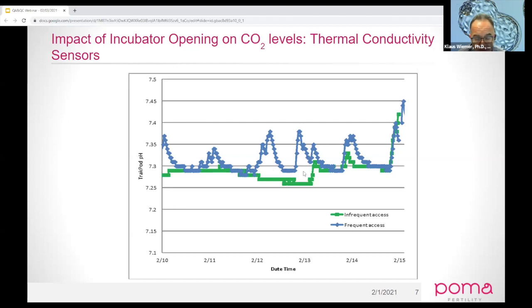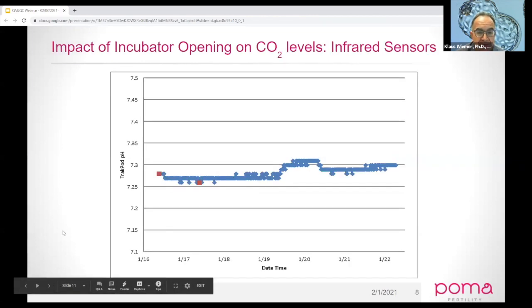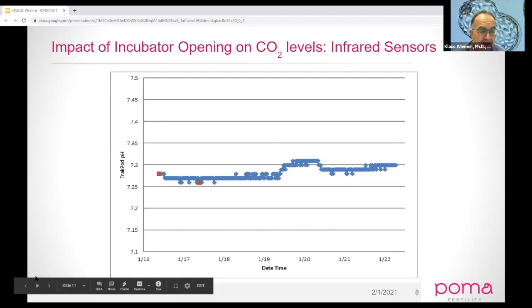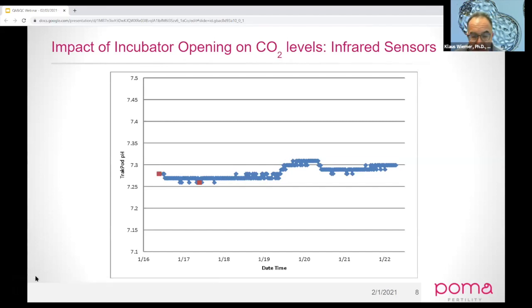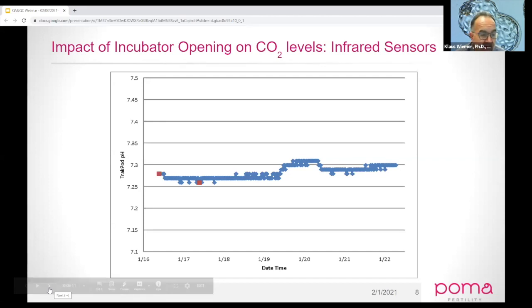This shows a CO2 incubator with just a thermal conductor sensor. With frequent openings, the pH in the blue lines is all over the place. With infrequent openings, we still have quite a bit of pH change. Whereas with an infrared type sensor, no matter how many openings occur, our pH stays in physiological ranges. So when looking at the QC aspect in your lab, the type of CO2 sensors will impact how long it takes for your dishes to equilibrate and stabilize. The type of sensor is really important — that's the take-home message.